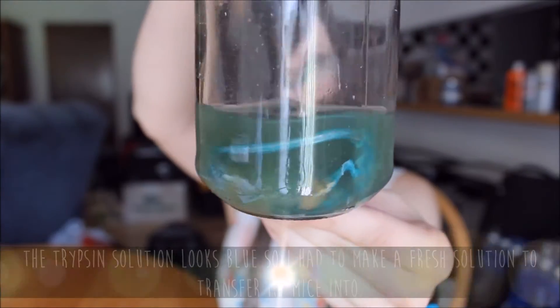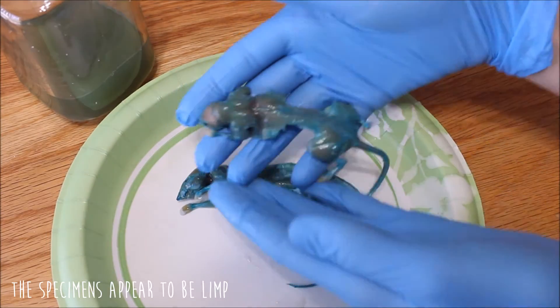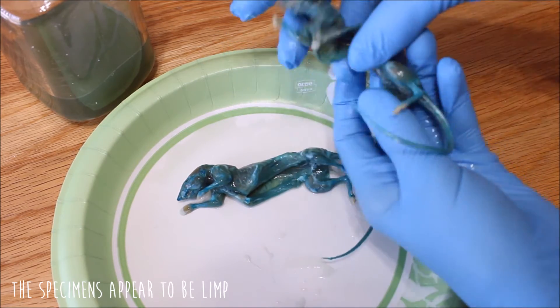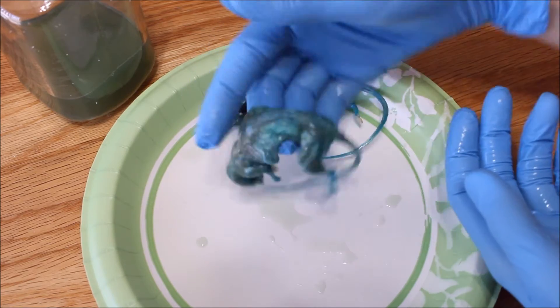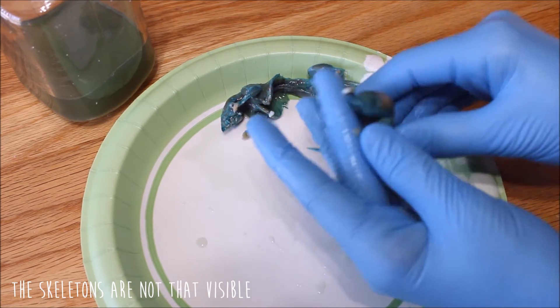My mice have been soaking in the Trypsin Digestion Solution for about three days now. After being in the Trypsin Solution for about one day, the solution my mice were in turned blue, which meant that I had to change the solution and put them into a fresh one. Let's go take a look at some of the clips from day one. After looking over the specimens, they are limp, but I can't really see their skeletal systems yet. So because the spine and bones weren't too visible yet, I left them in the solution for another couple of days.